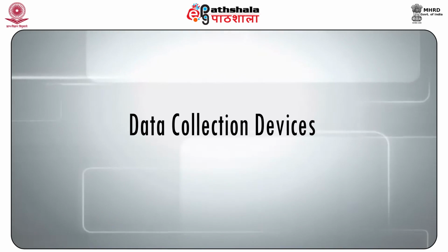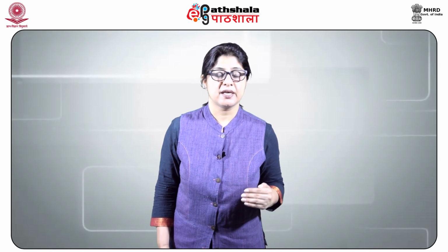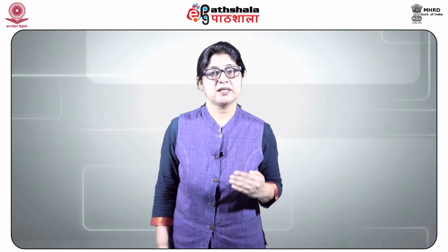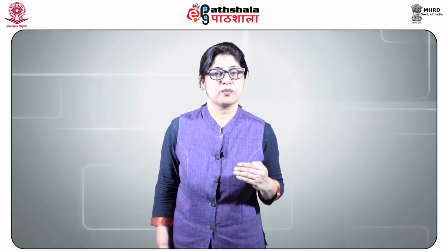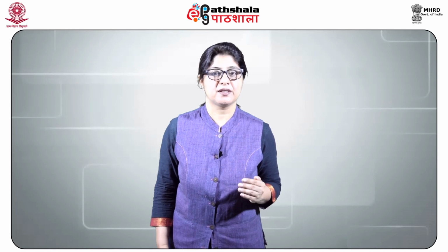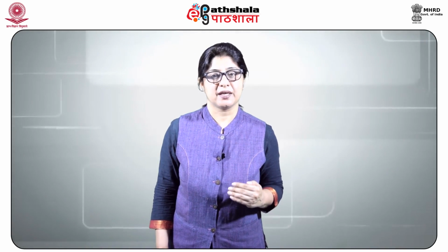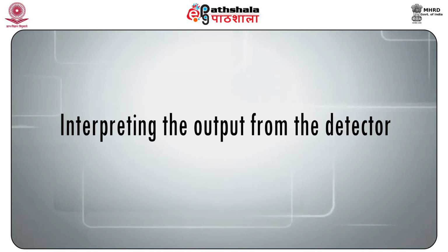Data collection devices, chart recorders and electronic integrators are used to collect the signals from the detector. These chart recorders and electronic integrators vary in their intricacy and in the ability to store and then process the chromatographic data. The computer integrates the signal of the detector for each constituent and produces a chromatogram that is easy to read and interpret. Interpreting the output from the detector.